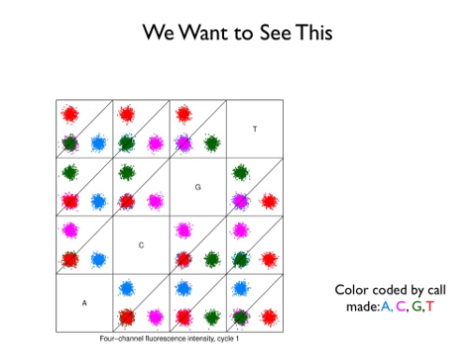All right. So if we were to make pictures of these data, there are 4 colors, and here I'm plotting them against each other in different ways. The first plot, down here on the left, plots the A intensities versus the C intensities. This isn't real data, by the way. This is what we would hope it would be like.